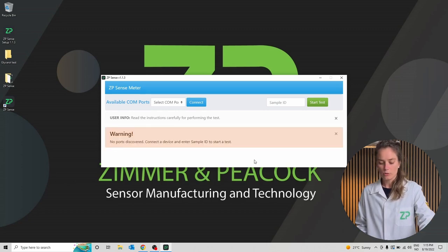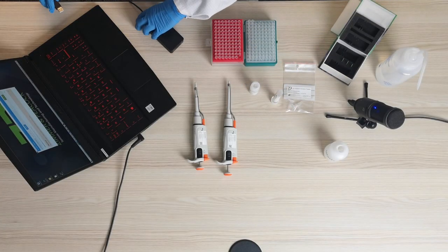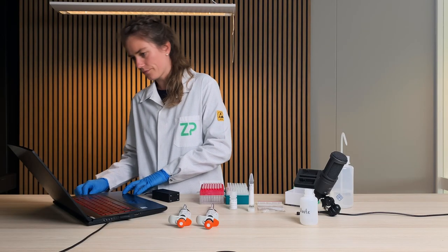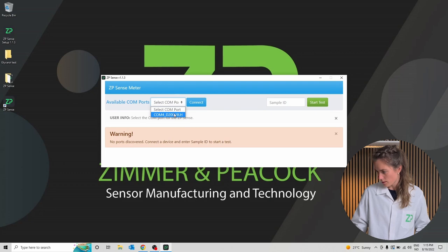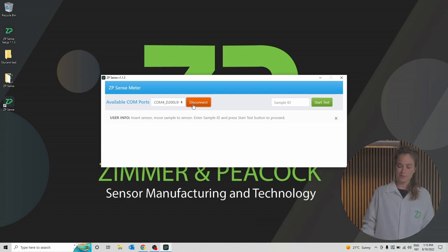It says that no meter is connected. So I will insert the CP meter into the computer using a USB port. I will select the appropriate port and click connect. The CP meter is now successfully connected to the computer.